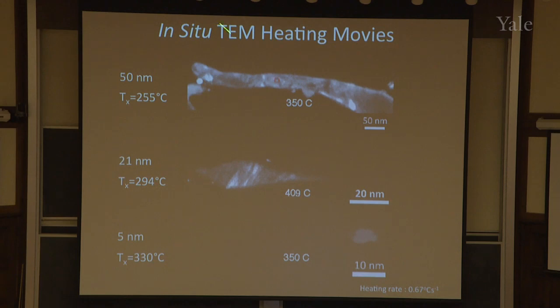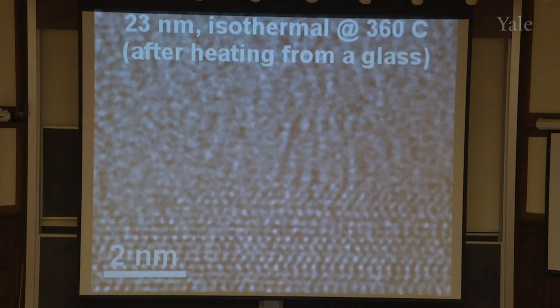So to find out, I zoom in on a really tiny region so that I can really see individual atoms. And I'm going to watch how this crystallization happens again. Crystallization means you're going from disordered to the ordered phase, amorphous to the crystalline phase. So now, this movie again. This is a really zoomed-in image of the previous movie, and now I'm really watching how the crystallization happens. This time it doesn't play, but you've seen this 3 times, so it doesn't matter. I'm going to go to the next slide.